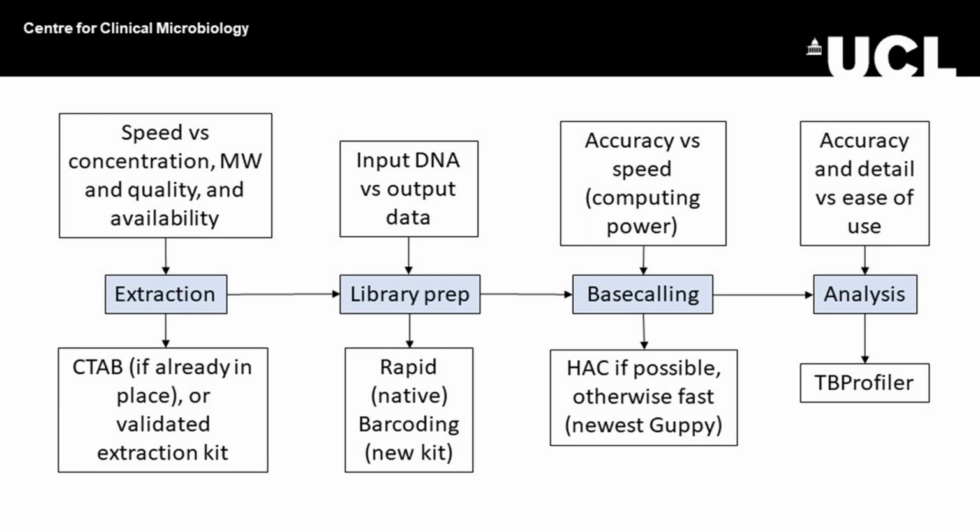And so the more depth you have, the more confident you are that each base is what you think it is. And so therefore it's much more accurate, which is something that has been leveled at Nanopore sort of compared to Illumina. So this kit is definitely much better.